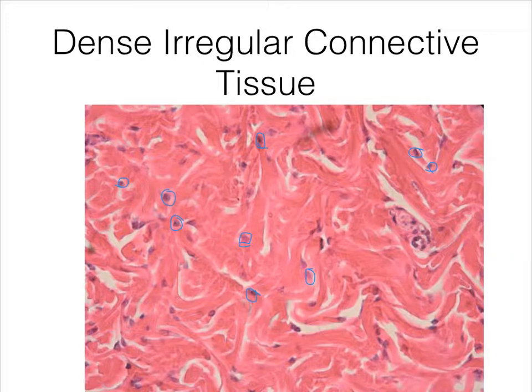The fibers themselves will be going a bunch of different directions, running around and underneath each other, and you will occasionally see these open areas where all of the fibers zig instead of zag, and you get sort of an open area.